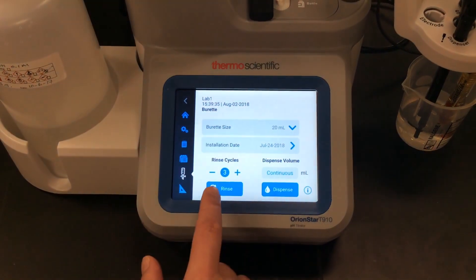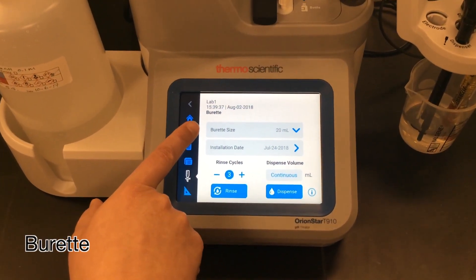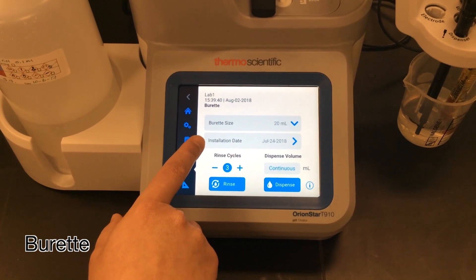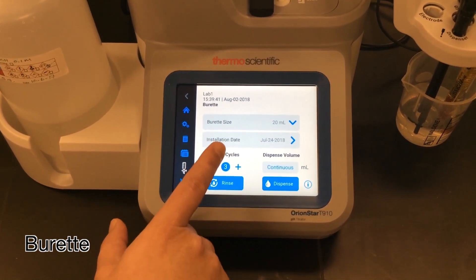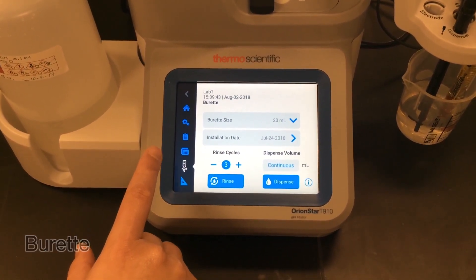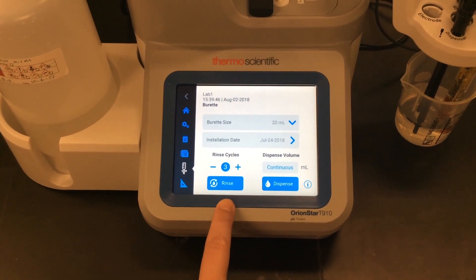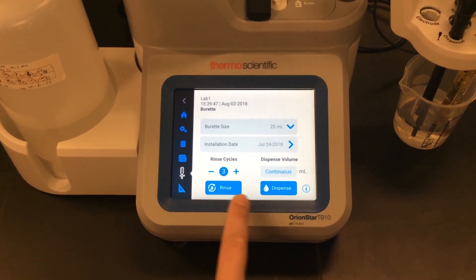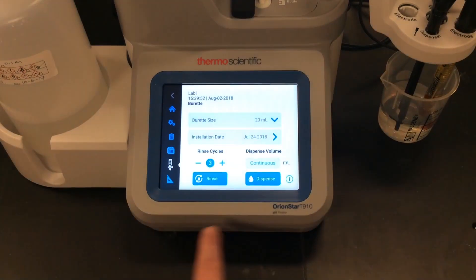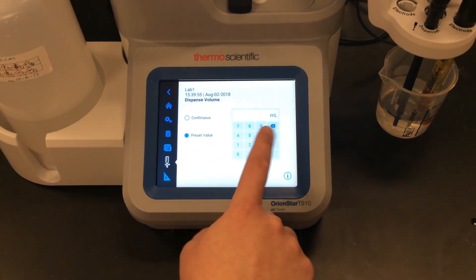The next screen is the burette screen. From here I can set my burette size and enter the installation date, which I can also use to set a maintenance reminder for myself to replace the burette. I can rinse the burette or dispense a certain volume.